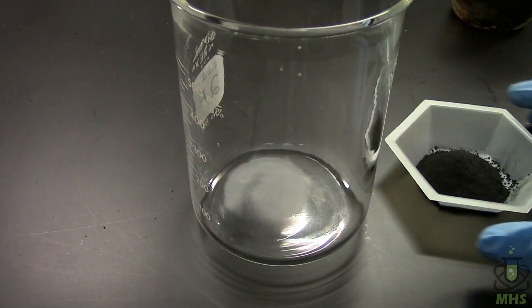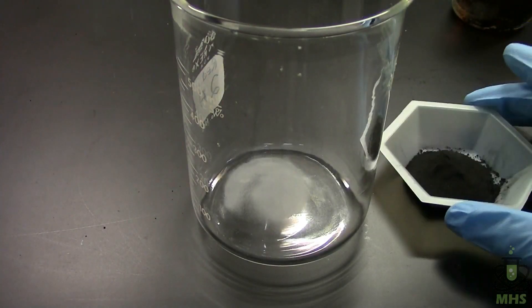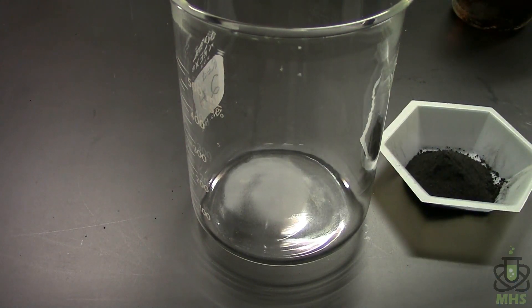Now I'm going to take the ground-down reaction products, put them in a beaker under water, and then very slowly add hydrochloric acid. That's going to react away everything that's not boron — the magnesium boride, the magnesium oxide, any leftover magnesium — anything soluble will go into solution or come out as a gas.